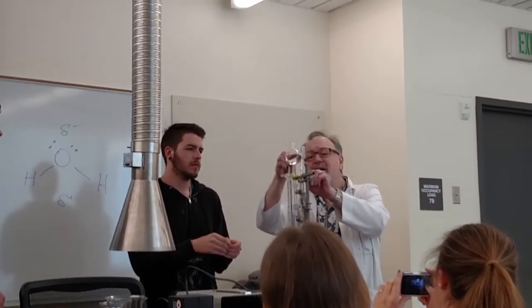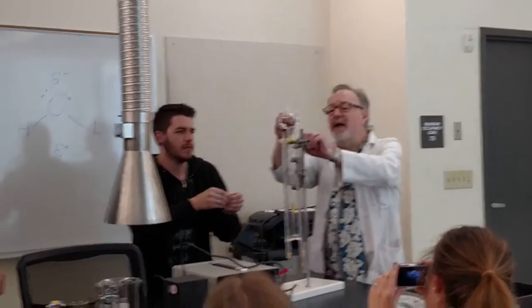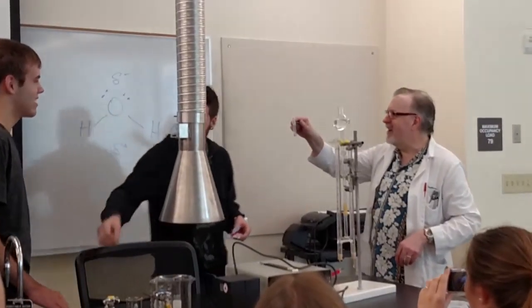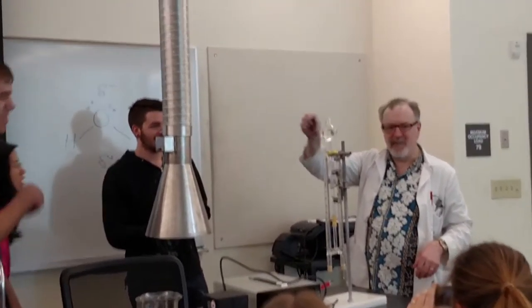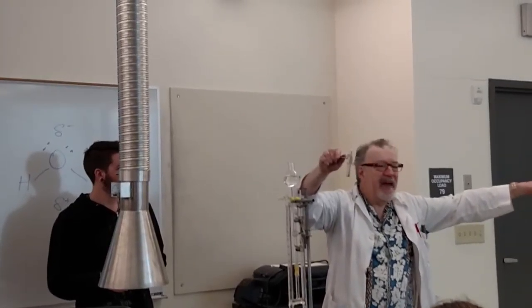It's in there. It's not very much. Amazing. Light it now. We just built some water by doing that.